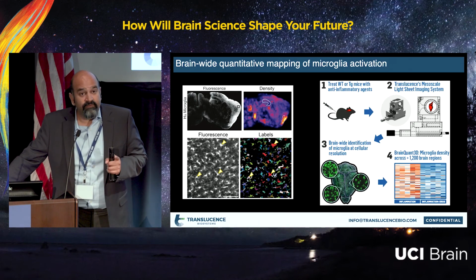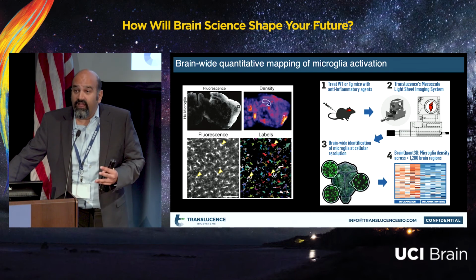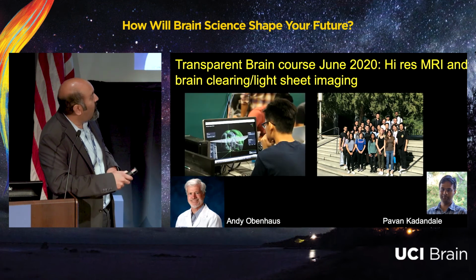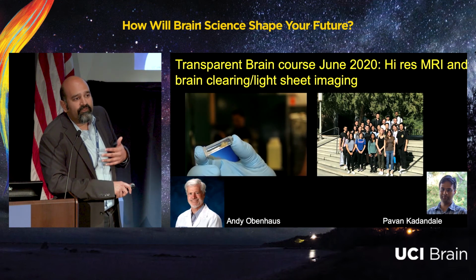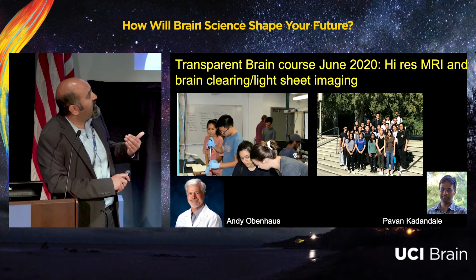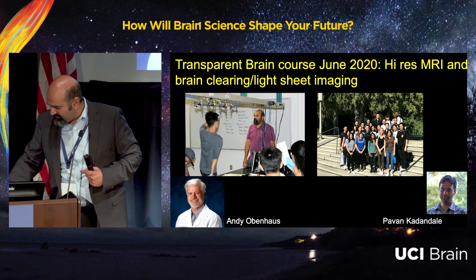So just to wrap up, I wanted to mention that although right now we don't have a resource per se other than collaboration to support getting people involved, the Optical Biology Corps, of course, has resources and is ready and willing to support people in learning how to use this new technology. I also wanted to mention that in June 2020, together with Zeiss Microscopy and my partners Pavan Kadandale and Andy Obenhaus, who you're going to be hearing from next, we're creating a course for the international community so that people can come and learn how to perform brain-clearing light sheet imaging and how to connect that on a different scale with high-resolution MRI. And with that, let me stop, and stop myself, which is my job right now.